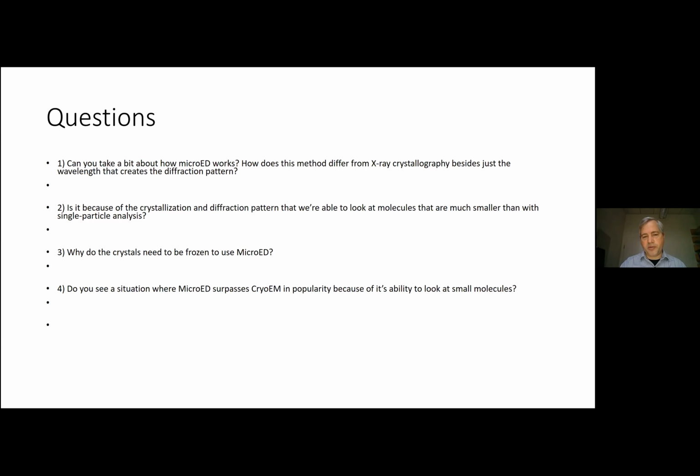For small molecules, if you can get powders of them, they don't need to be frozen. You could collect MicroED of them at room temperature, although they would probably be a little bit more sensitive to the beam, so you might get them damaged faster. If you're using an autoloader system, then the autoloader system is naturally cooled, so you don't have to worry about it. But I would say powders don't need to be frozen, but things that are hydrated need to be frozen.